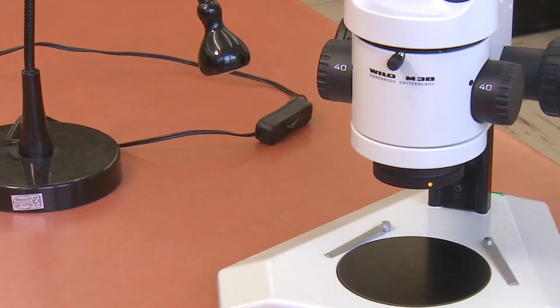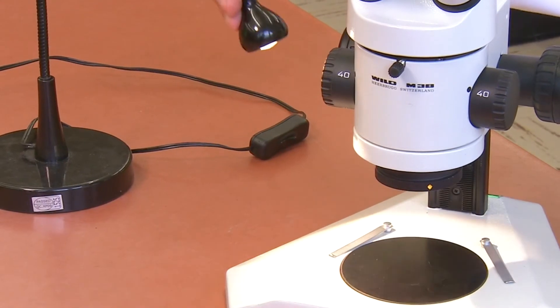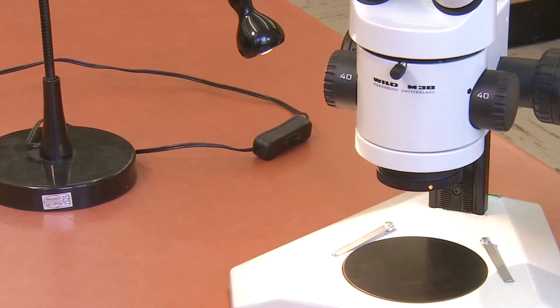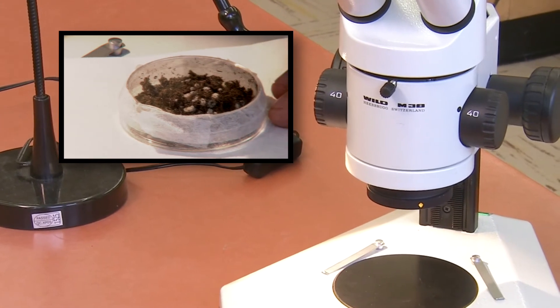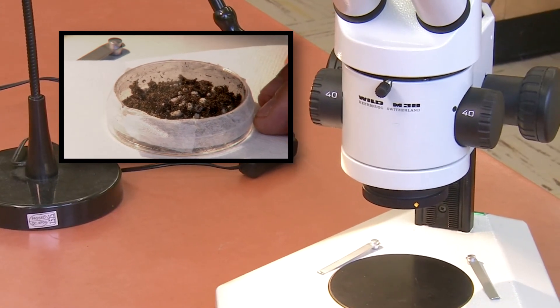These dissecting microscopes don't have their own light source, so you can use the lamp on your bench to provide light if you require it to view your specimen. If you need to move your specimen, you will have to do this by hand, so it is often easier to put your specimen on a slide or piece of paper towel so it can be easily moved under the lenses.